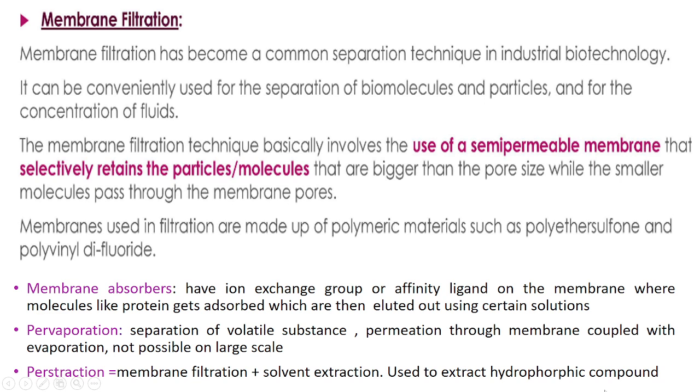Then you have something called a membrane adsorber. These membrane filters will also have an ion exchange group or an affinity ligand on the filter. So whatever protein you're separating will get adsorbed onto the filter, and after the process is completed, you can easily elute it out.